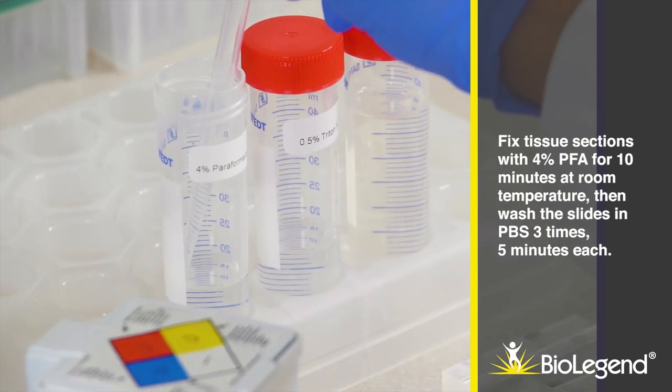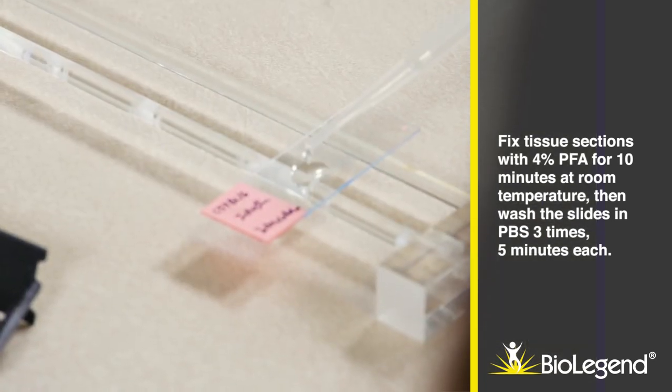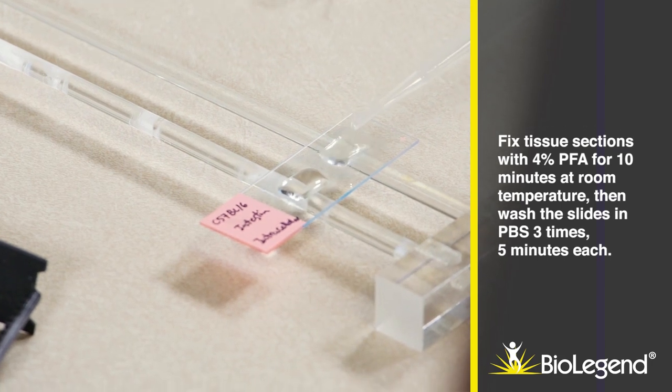Fix tissue sections with 4% paraformaldehyde for 10 minutes at room temperature. Then wash the slides in PBS three times, 5 minutes each.